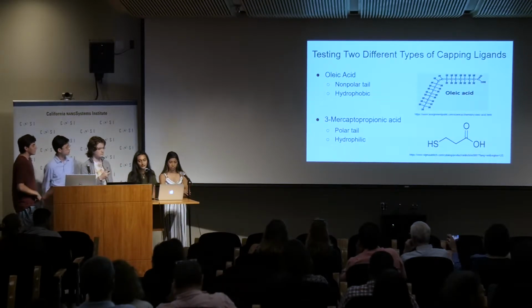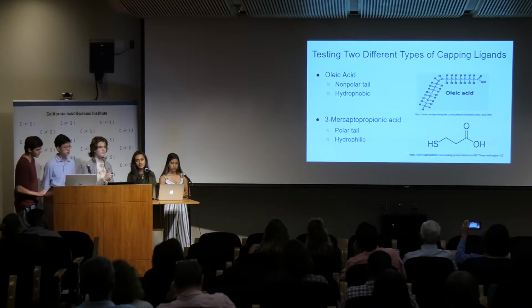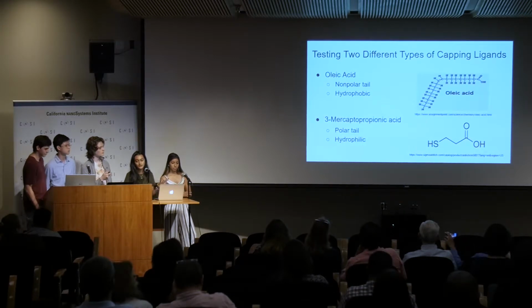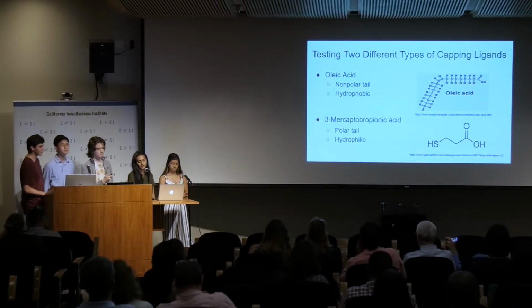The two different capping ligands that we were using were one that was nonpolar and one that was polar. A lot of us are familiar with the concept that like dissolves like, which is similar to what we used in our experiment. Just like how oil and water don't mix, nonpolar and polar substances do not mix. So we were testing the properties of these two different types of capping ligands.